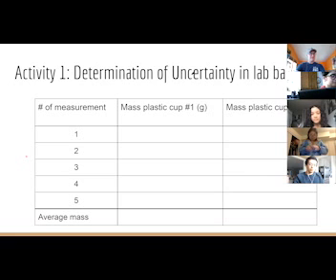All right, so I'm going to give myself a little more room to work here. So you want to have this on a flat surface. That's really, really important. So that goes on a flat surface. You hit the power button, and then make sure you select, it should say G somewhere. If it says GR, that's actually grains, which is a really old system of measuring mass. Then I think CT is carats, and OZ is ounces. So you want G for grams.